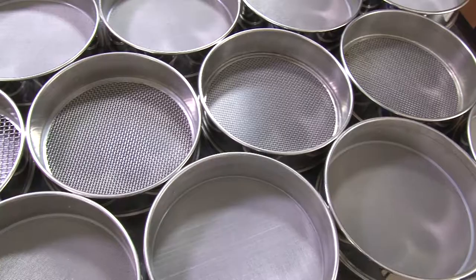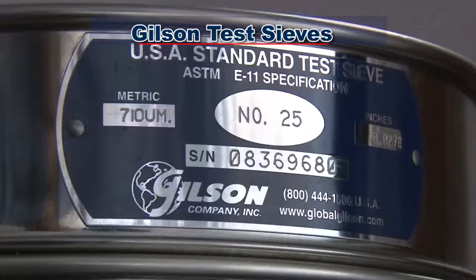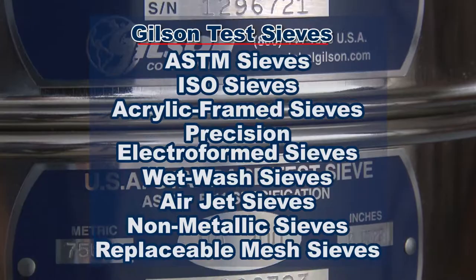Starting with Gilson's test sieves, Gilson stocks the widest selection and the largest quantity of sieves than any other materials testing supplier. Whether you need ASTM test sieves, ISO test sieves, acrylic frame sieves, precision electroform sieves, or any number of specialty sieves, Gilson sieves are ready for immediate shipping or fast custom order delivery.